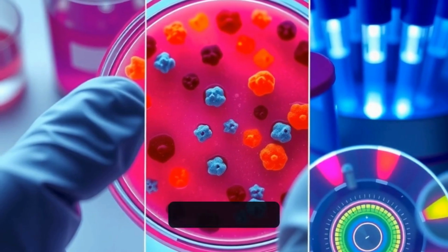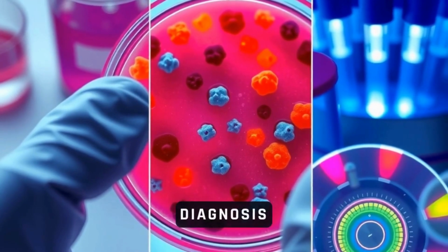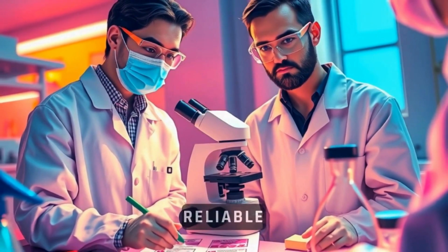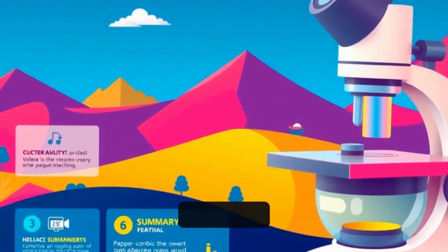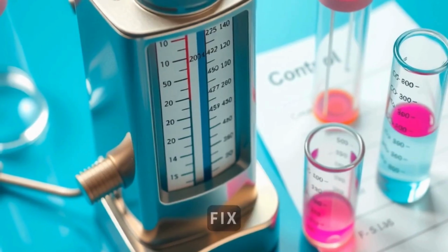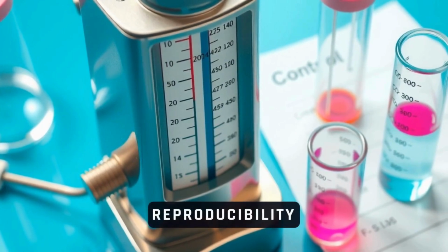Remember limitations. Staining gives preliminary data, but often needs culture, molecular tests, or susceptibility testing to confirm diagnosis. Good laboratory practice, reagent quality, and trained personnel are essential to ensure accurate staining and reliable clinical interpretation. Quick summary: staining improves contrast, reveals structures, and differentiates organisms to support diagnosis and research. Practical tips: always fix slides properly, follow reagent timings, use positive and negative controls, and document procedures for reproducibility.